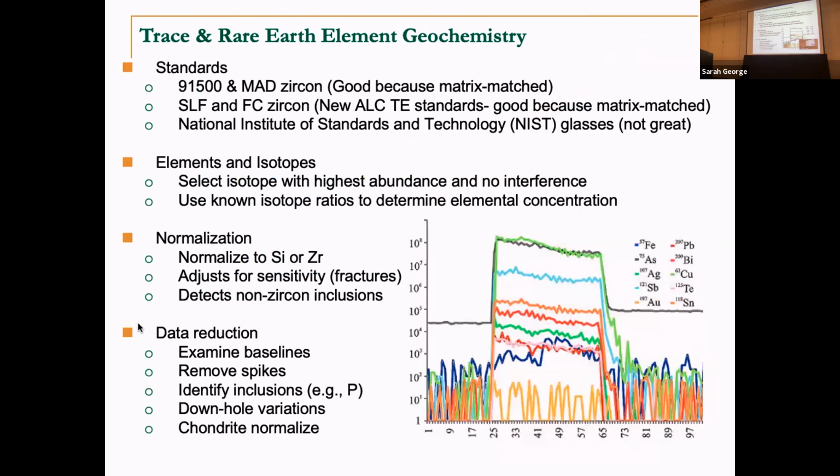Okay, one of these big bag standard slides. What do we do? How do we measure it? I don't want to go into this in too much detail. The key thing here is you need good standards. You need zircon standards. You can't do this with a glass.